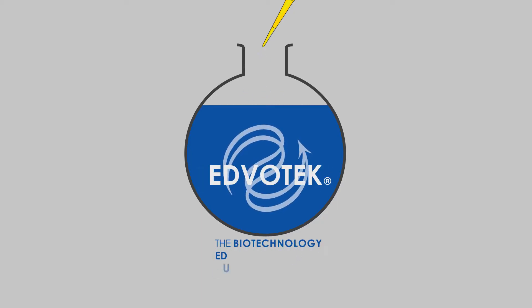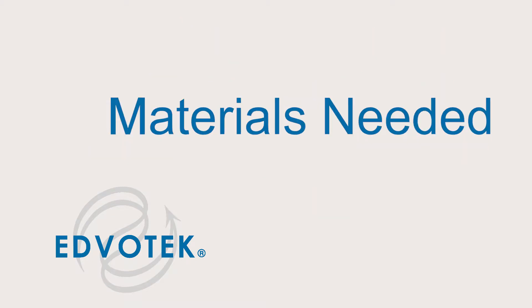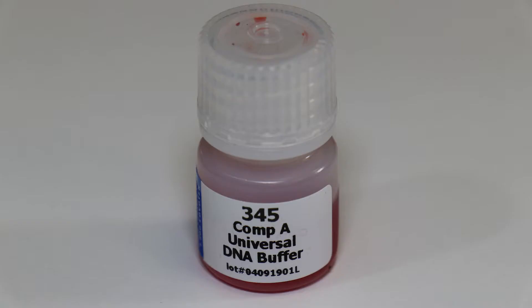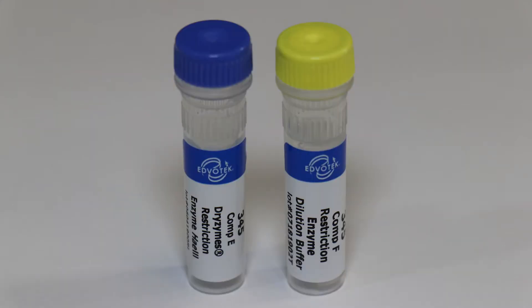Edvotech instructional videos presents pre-lab preparations for experiment 345: exploring the genetics of taste. Before beginning preparation you will need Component A universal DNA buffer, Components B, C, and D: TE buffer, lyophilized primer mix, and lyophilized control.